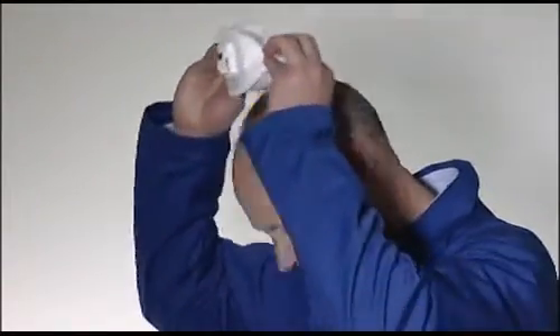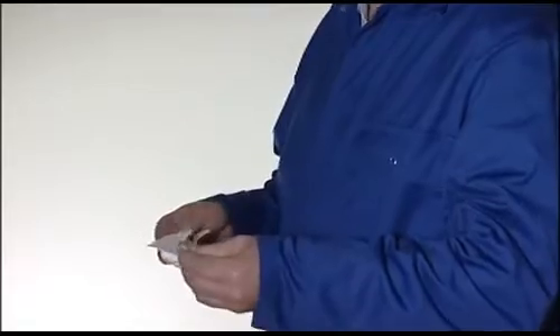When the respirator is not required, for example when you're on a break, it may be folded and returned to its wrapper.